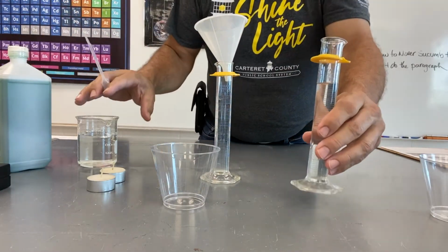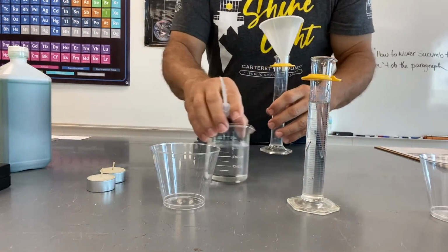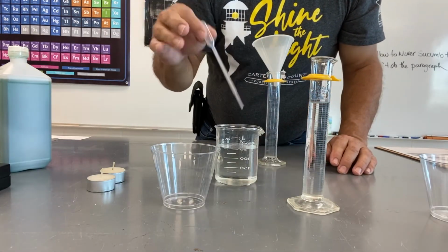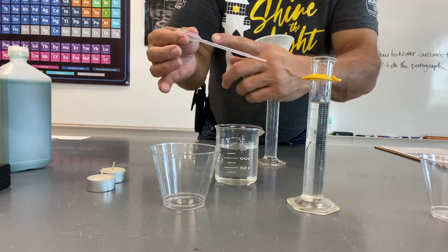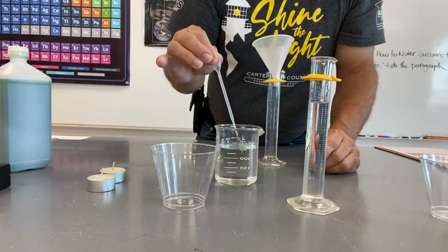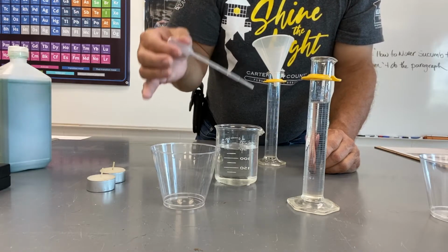So what I'm going to do is I'm going to be a proper scientist. I'm going to use a transfer pipette. This is just like an eyedropper. It's called a transfer pipette. It's a small pipe. There's the pipette part. And the transfer part is that I'm going to transfer liquid from one thing to another.